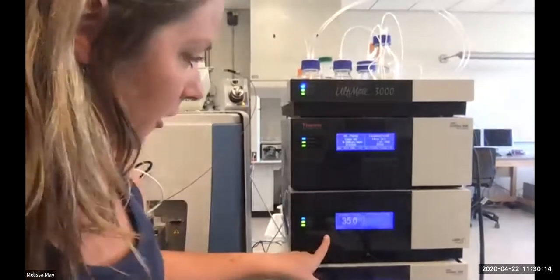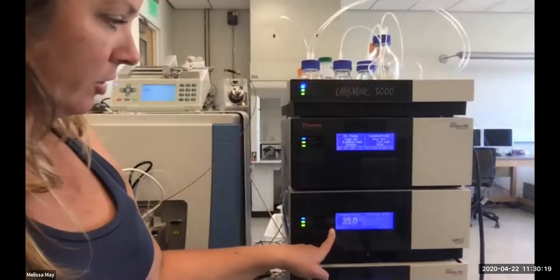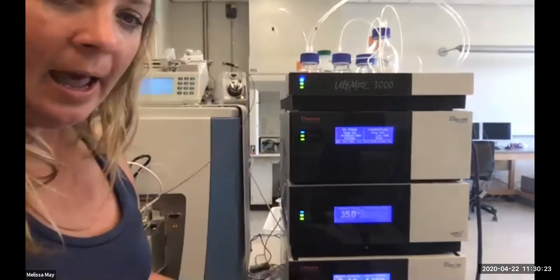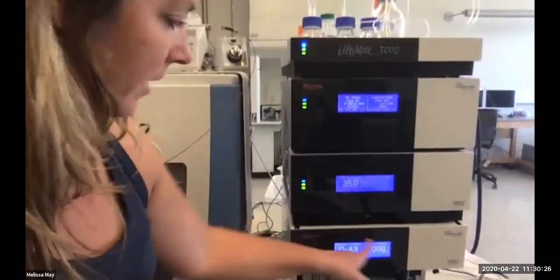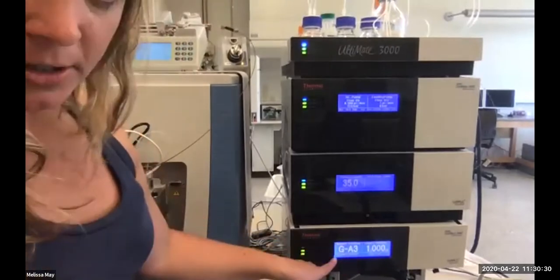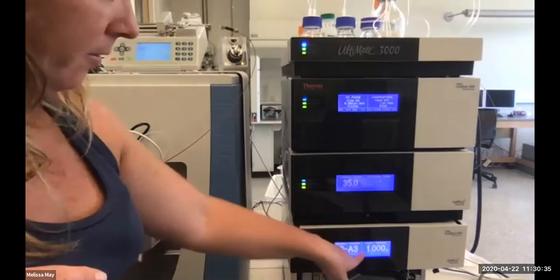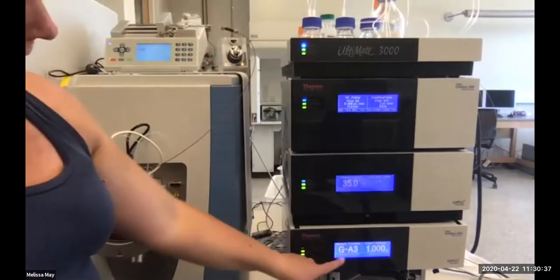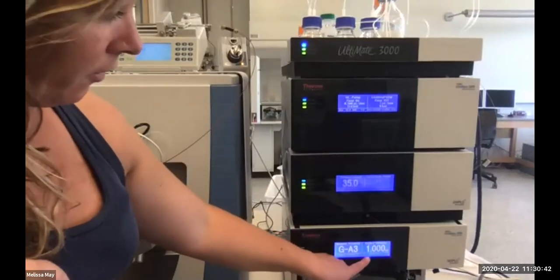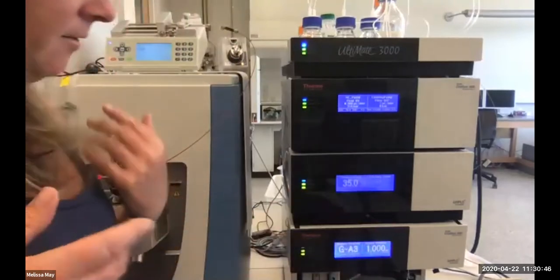Down here, this is our column oven. Again, this tells you what the compartment temperature is set at, which currently is 35 degrees Celsius, and our switching valve is in the 1-2 position. And then finally down here, we have information about the auto sampler. So you have the sample position. The last file that I sampled was in GA3, which means green, A, first row, 3, third column. The sample is being held at 4 degrees Celsius. My injection volume was 1 microliter, and it's in the load position instead of the inject position.